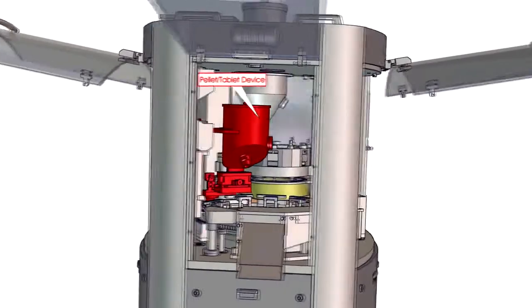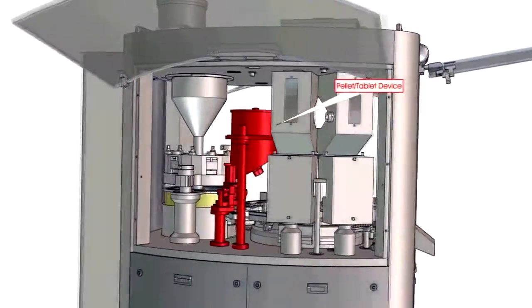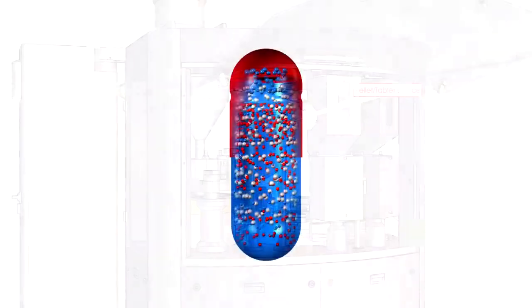Able to adjust the thickness of pellet blocks so that it allows accurate measuring of drug weight that is inserted into the capsule.